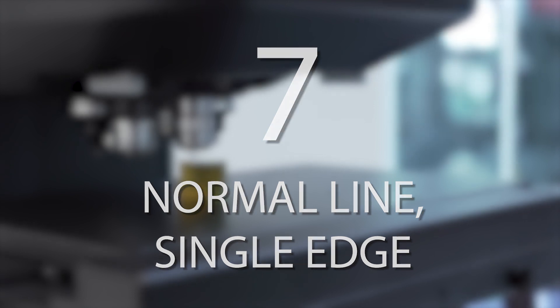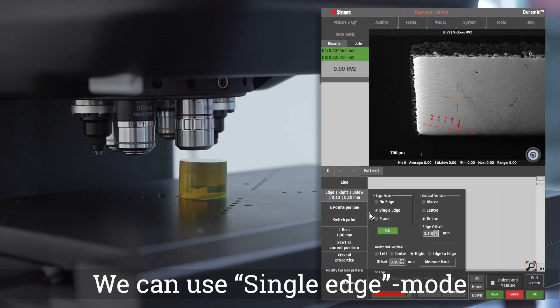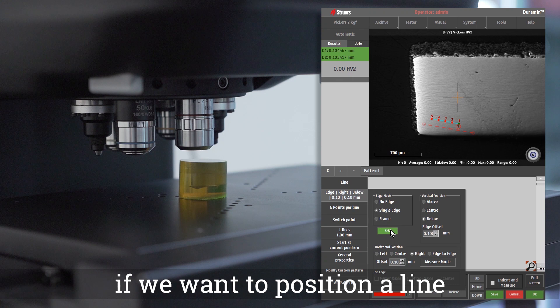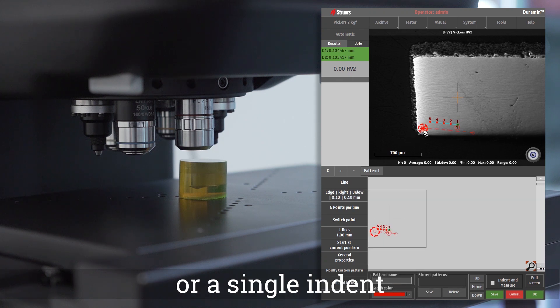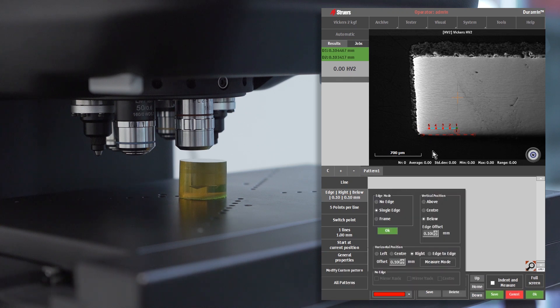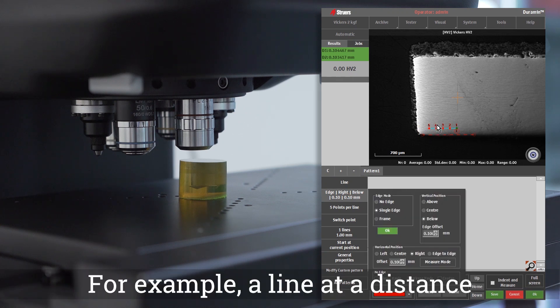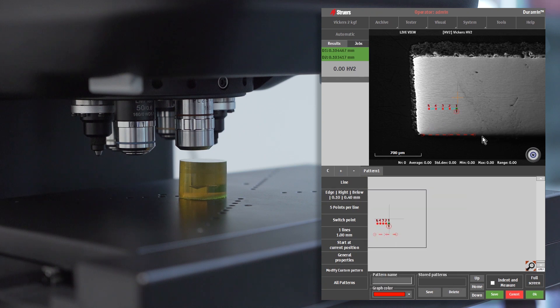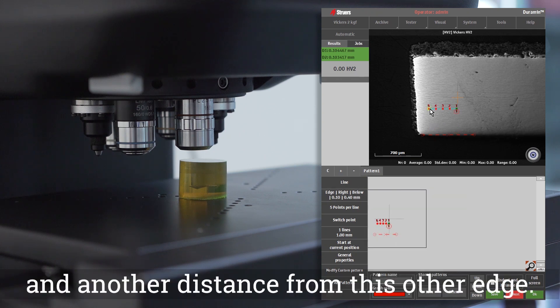Normal Line Single Edge. We can use Single Edge Mode if we want to position a line or a single indent at a specific distance from two edges. For example, a line at a distance from this edge and another distance from this other edge.